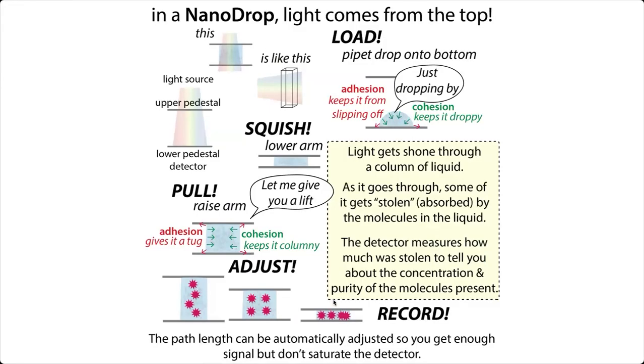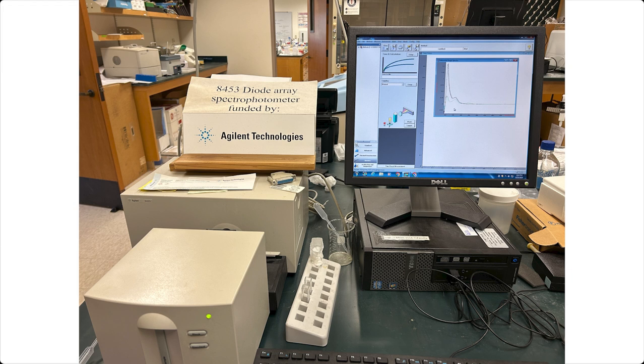that shines light and records. If you want to be more accurate, you can use an actual spectrophotometer where you're using cuvettes. You might need to dilute your sample first, and you don't want to waste your sample, so you either want to have a really clean vial, or you might want to use a semi-micro cuvette where there's a smaller little window, so you waste less of your protein sample. That's going to be more accurate than the nanodrop.